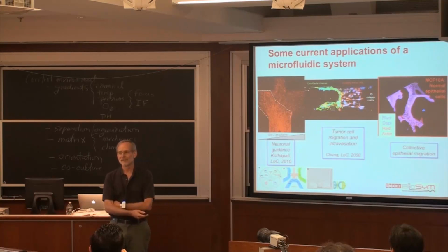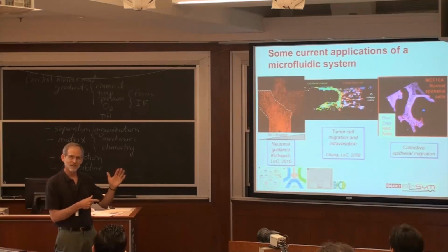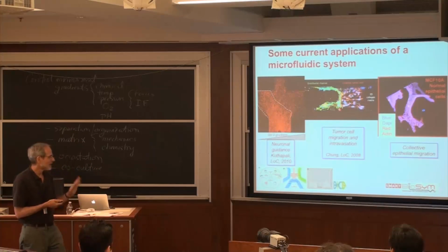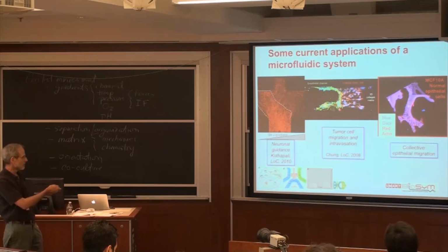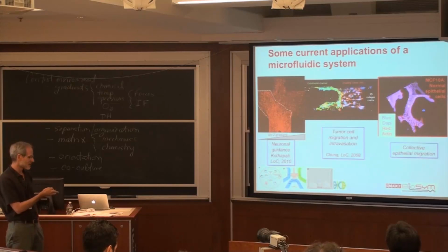Macrophages tend to, again, promote the migration of the tumor cells to the endothelium and then transmigration. So the percentage of cells that can transmigrate tends to increase by at least a factor of 2 and probably more. And here's a case where we've just grown epithelial cells on the surface. Those epithelial cells form these nice ductal structures. Again, you can replicate some things that happen in vivo.